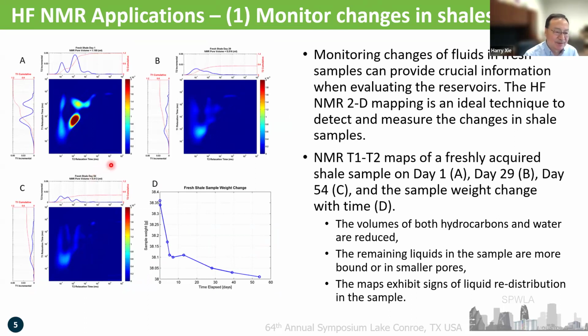change. We all know the shale sample, if you drill it out of a well, it will take some time for the liquid inside the shale to evaporate. But how quickly, how slow, and what's the dependence of the evaporation? So we can study it with NMR. So this is one example. We take a fresh sample just drilled, from the well site we take a sample to the lab, we do the NMR measurement.